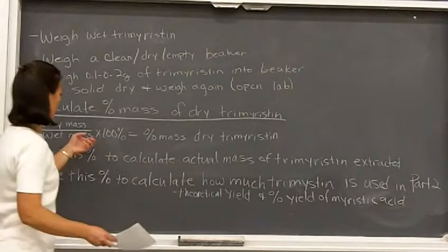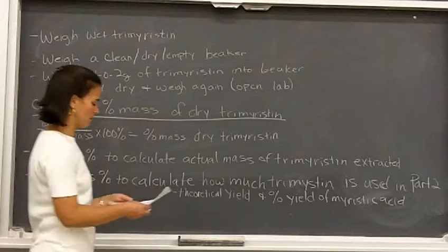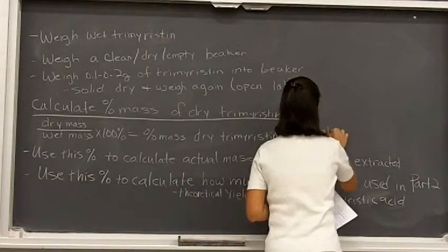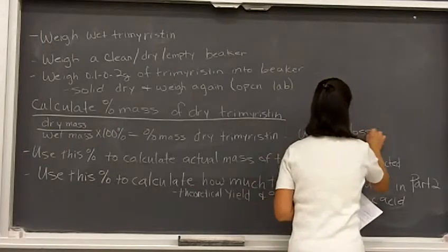The other thing you're going to want to do once you have this number is figure out the weight loss on drying. Okay?